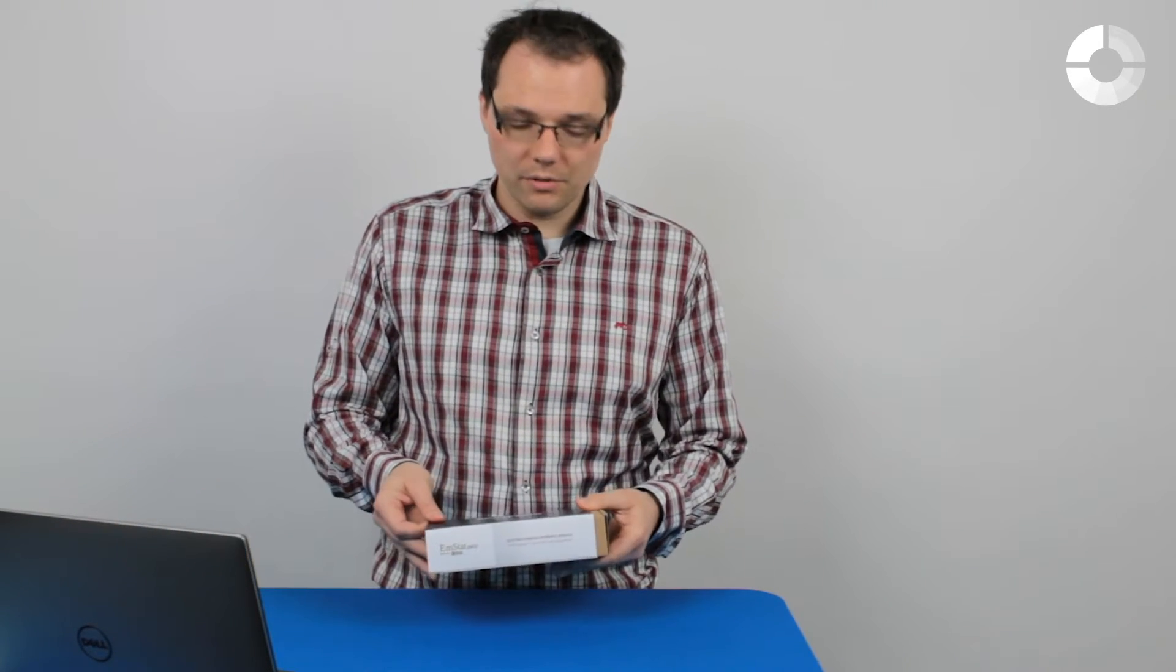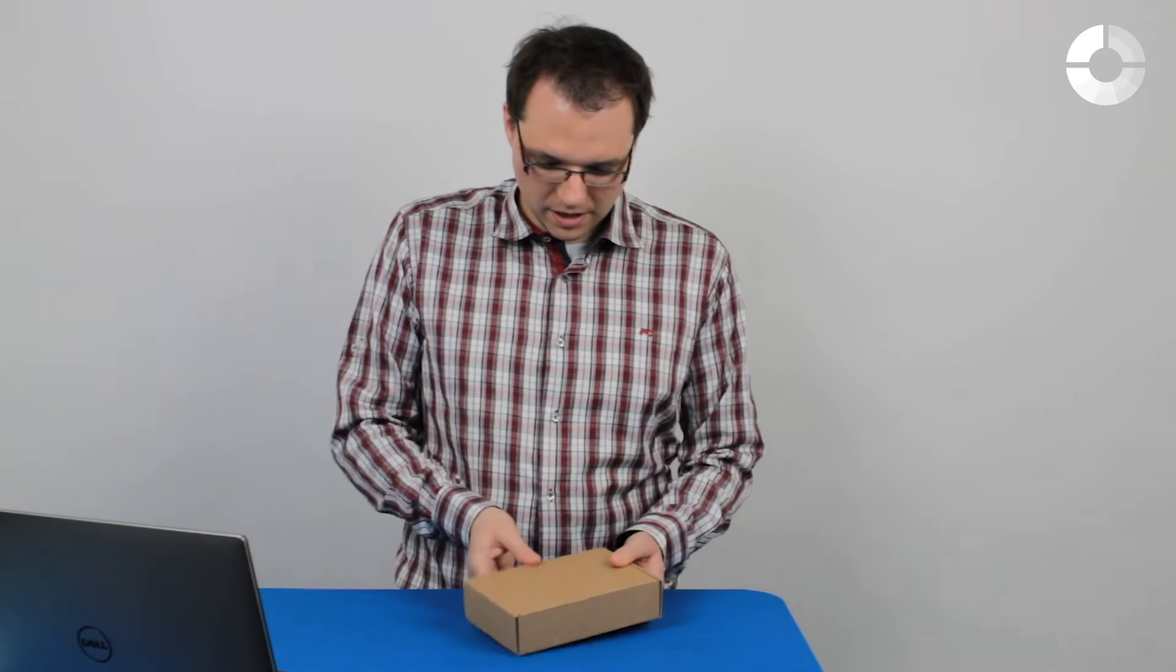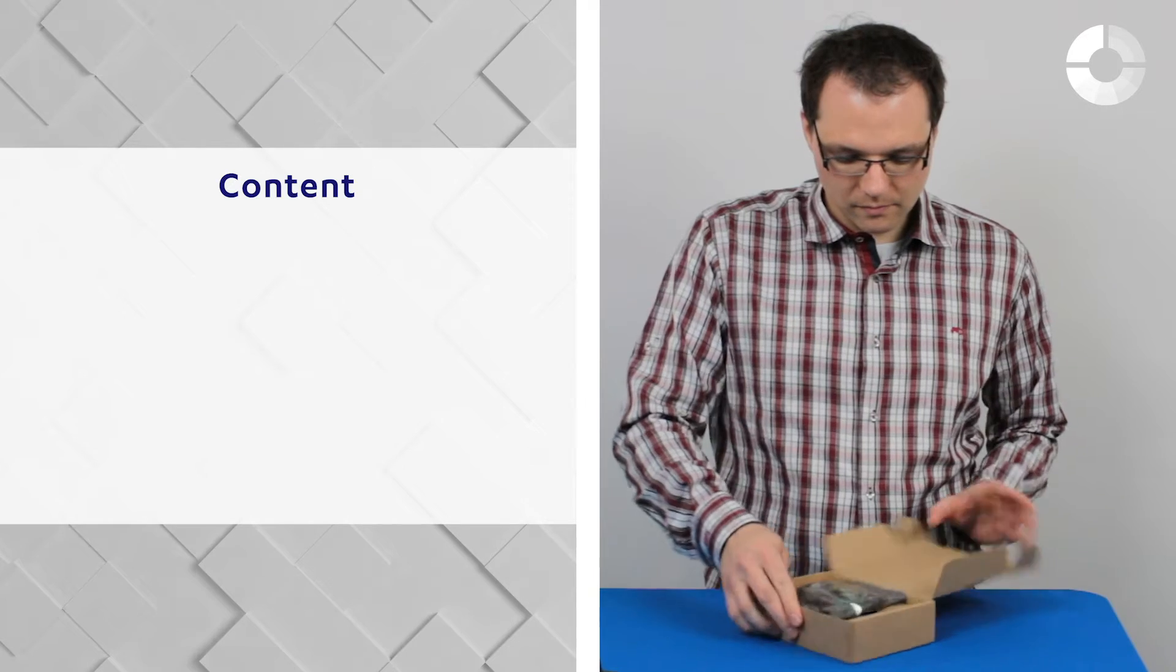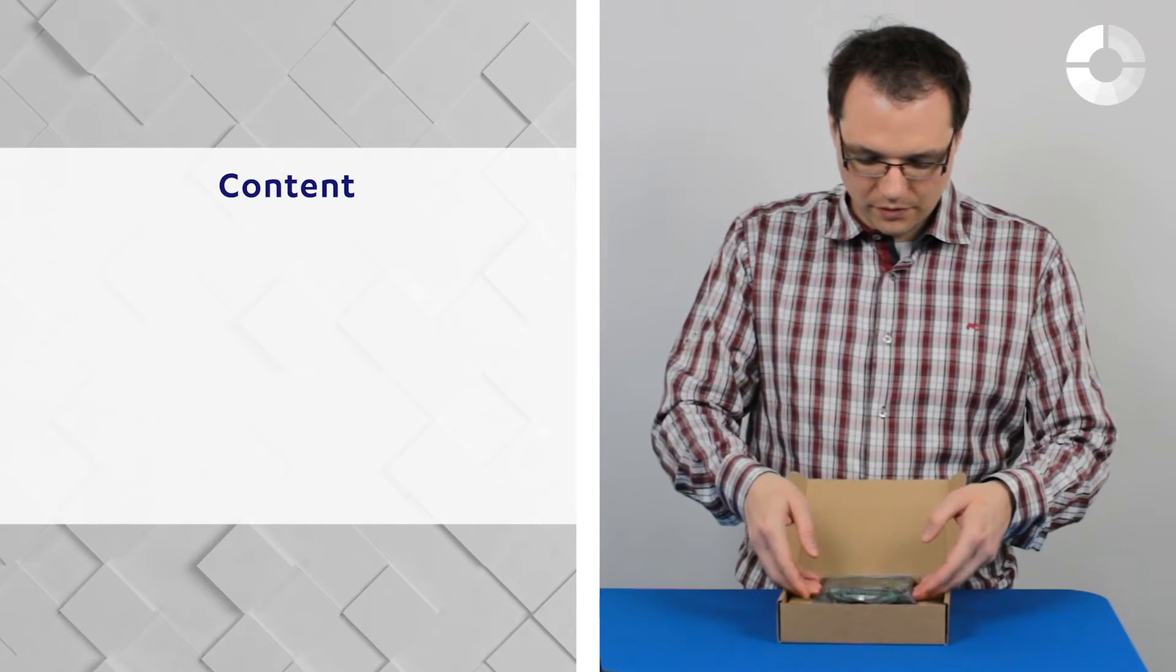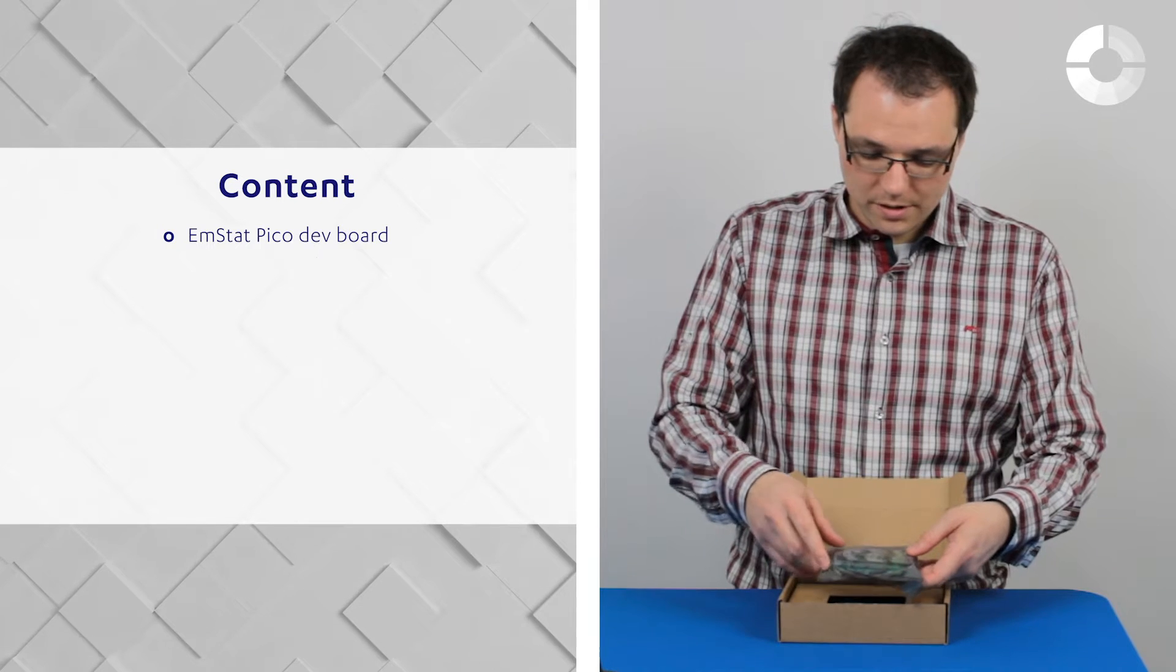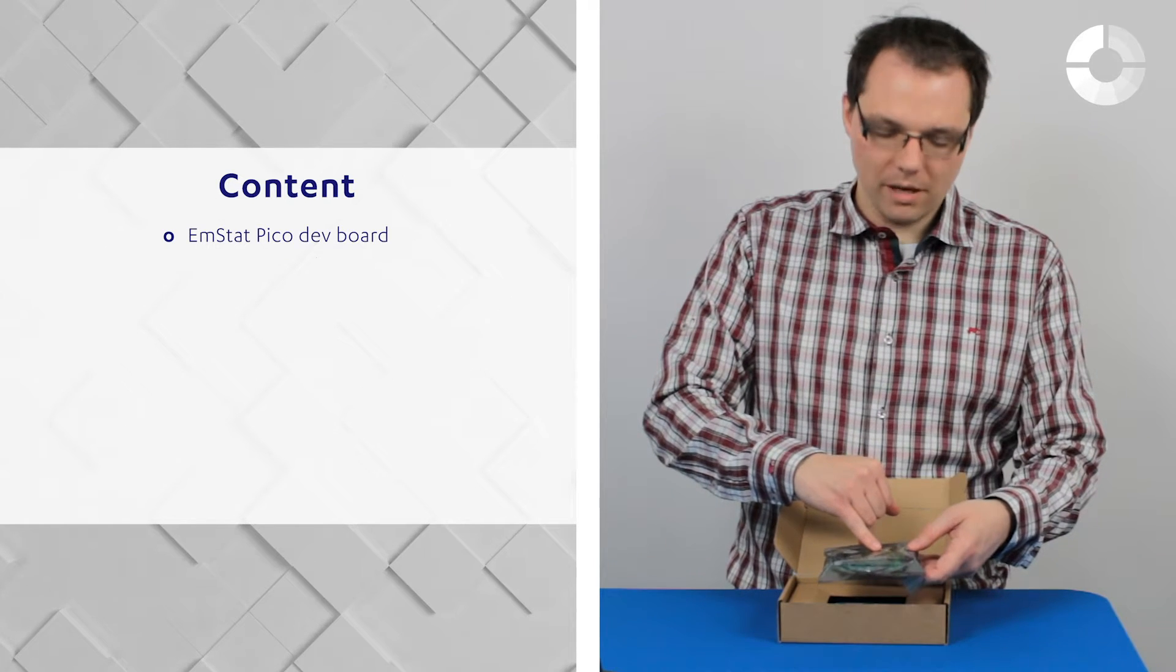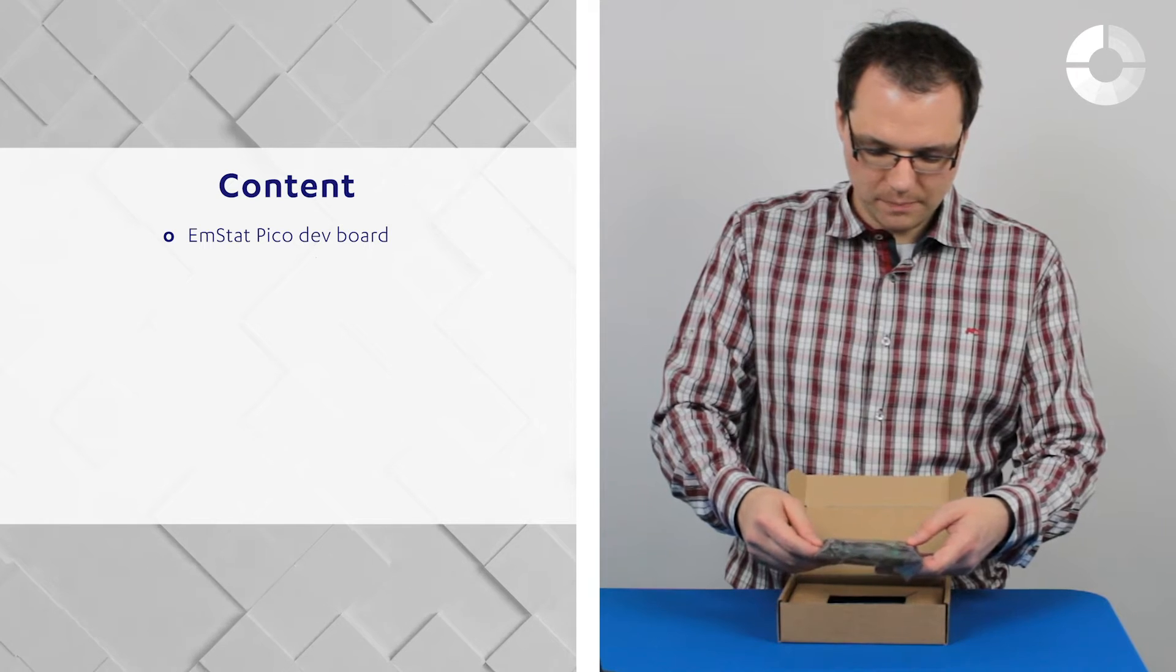So this is how it arrives. You take off the sleeve and open the box and inside you will find the Amstead Pico development board with the Amstead Pico already mounted to it and with a micro SD card.